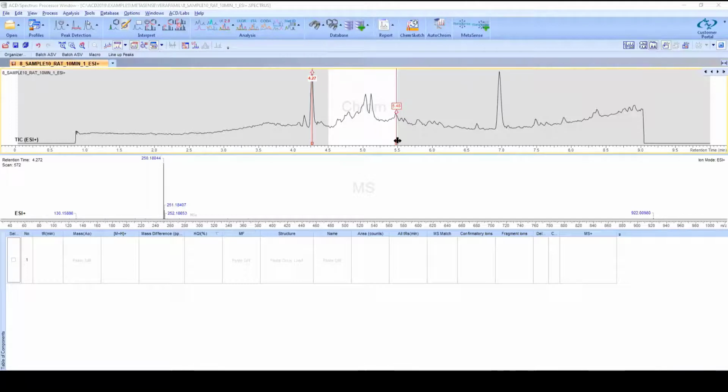Okay. So the first step of the workflow that Nikki had explained was separating components. There are two ways to do this within the software, dependent on whether you're going to search a user-created database, or if you're going to go with the second part of the workflow, where you're just generating the formula and then searching ChemSpider and PubChem by mass.